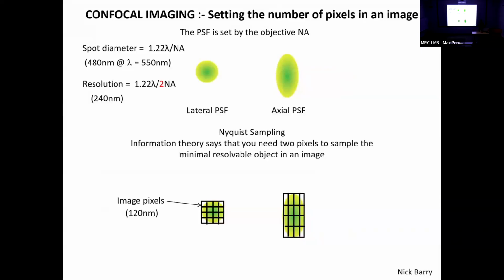You don't necessarily know this when you're operating the microscope, but luckily they give us a button to press that gets you to this situation without you having to calculate all the numbers. And typically, you're going to see in a confocal microscope that if you're capturing the diffraction limited detail, you need pixels at around 100 or so nanometers. I mean, often it can be smaller than that.